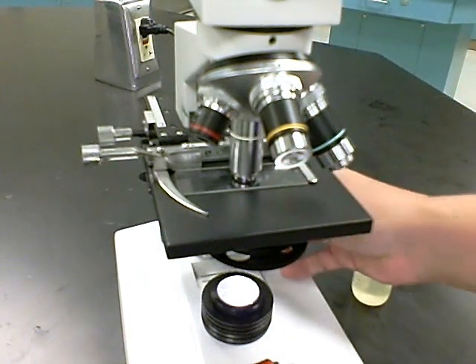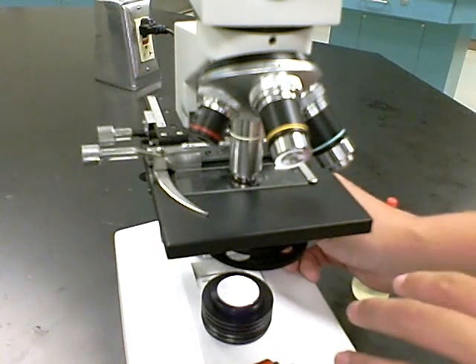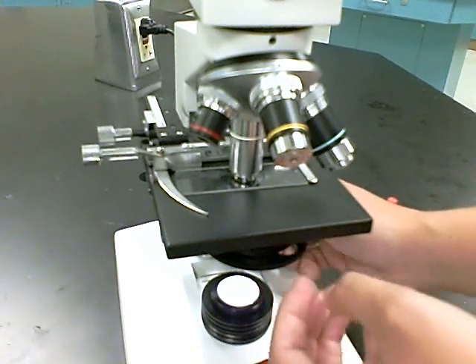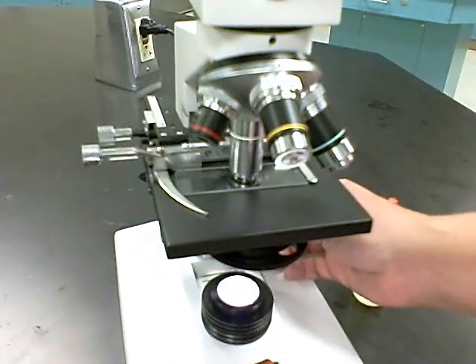And again, because these are parfocal, you should still have your specimen slightly in focus. You might need a little bit of fine adjusting, as well as increasing your diaphragm here, again giving you the greatest amount of light going through the specimen as well as the highest resolution.